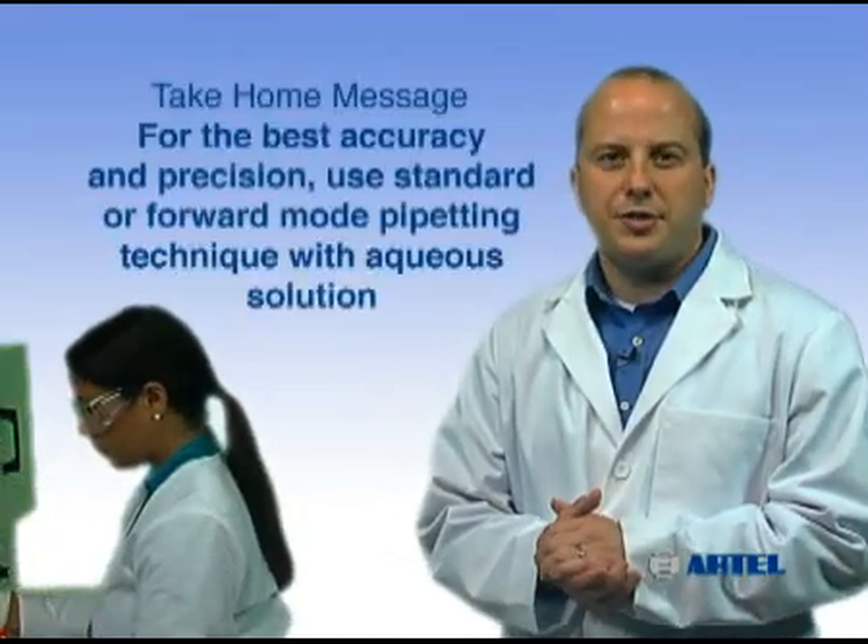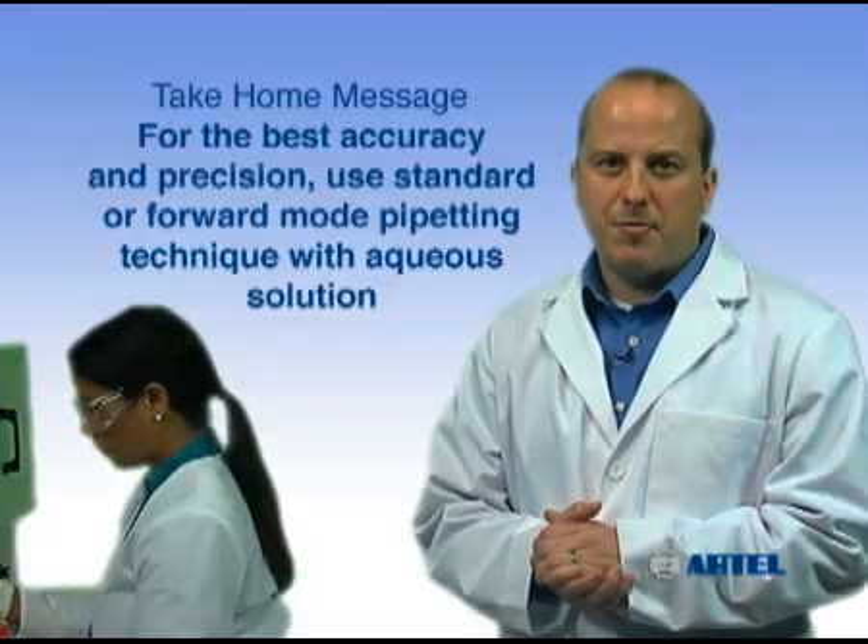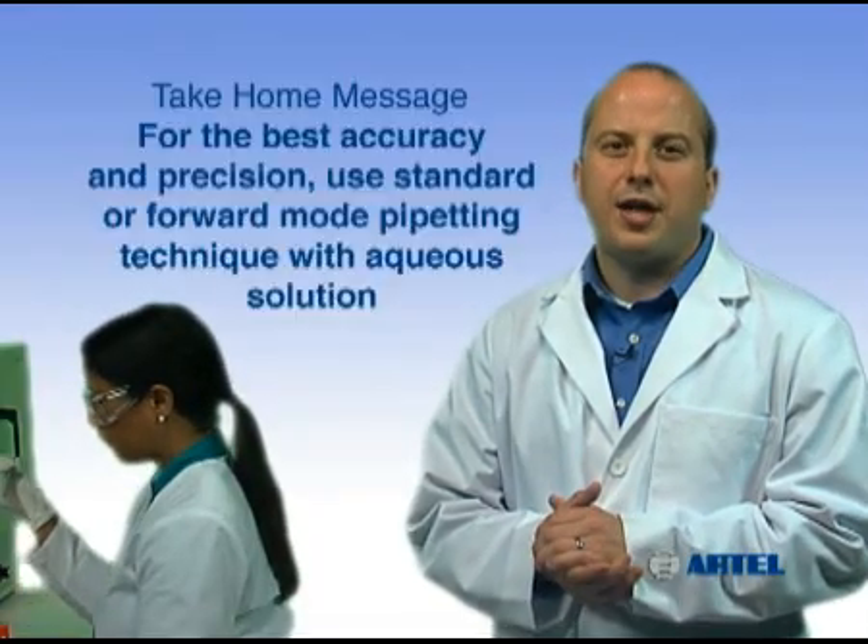Reverse mode may be the method of choice for pipetting viscous or volatile solutions. The take-home message is: for the best accuracy and precision, it is recommended to use standard mode pipetting technique when transferring aqueous solutions.